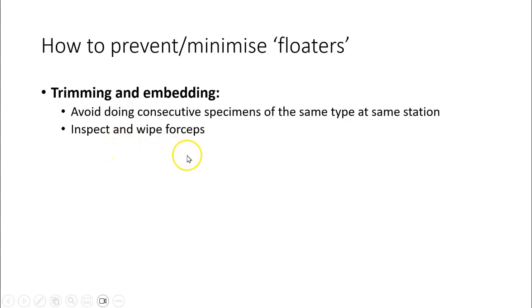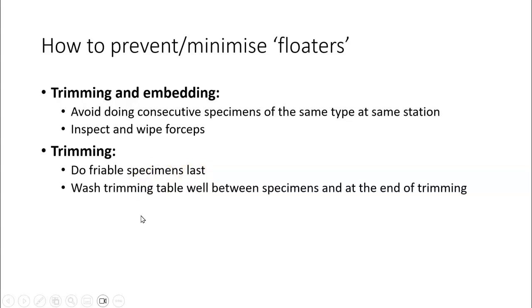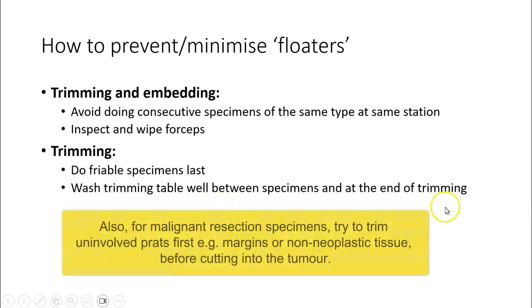Inspect and wipe the forceps. Make sure the forceps are clean between specimens. And for trimming, you can do the friable or the messy specimens last. Those are likely to shed a lot of material. And wash the trimming table well between specimens, also at the end of trimming.